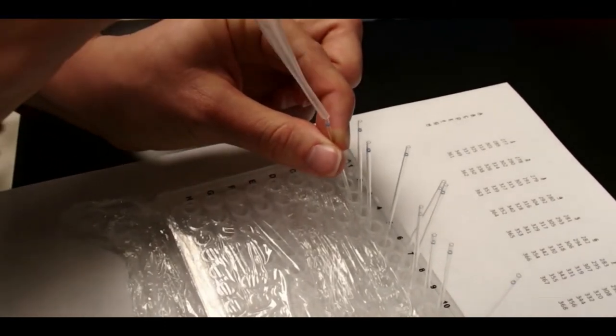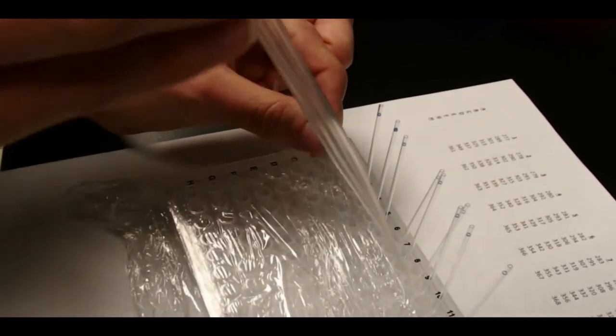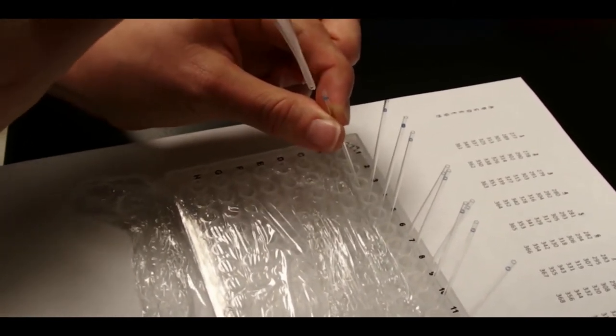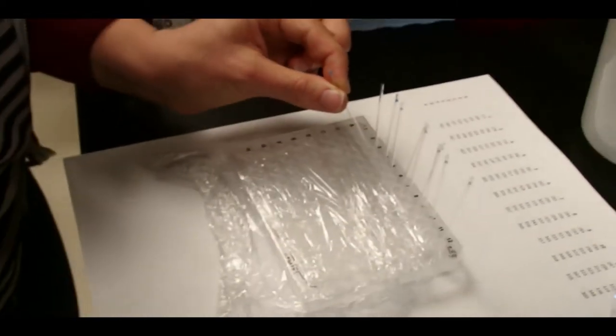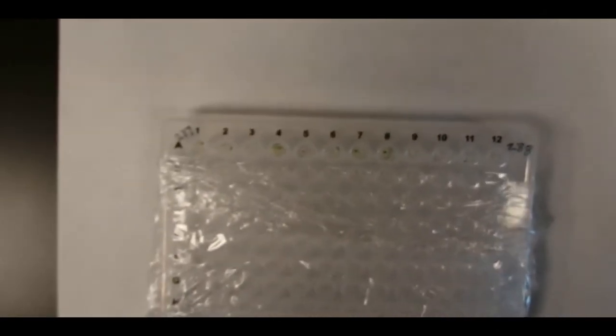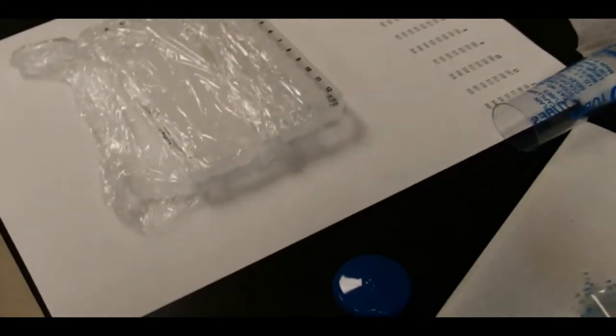Sometimes the disc will be unfriendly and not want to come out. Got it? Got it. All right. Now all of the first row has leaf discs in there, and you can see a little bit of green in there. It's hard with the camera angle. But now we're going to cap these guys. It's not important to have the disc on the very bottom because we're going to spin this down very hard prior to doing the heat step.